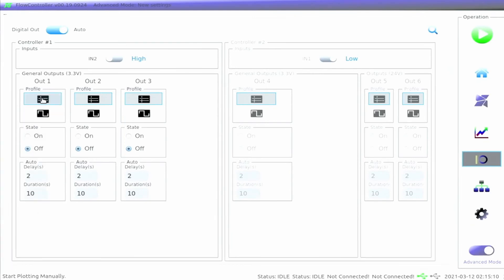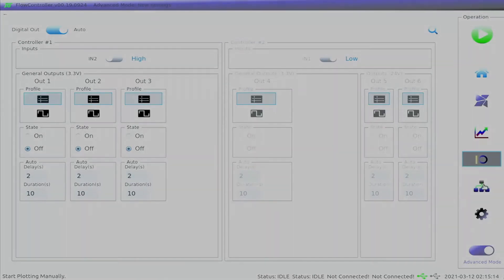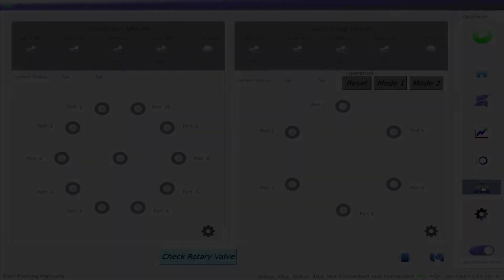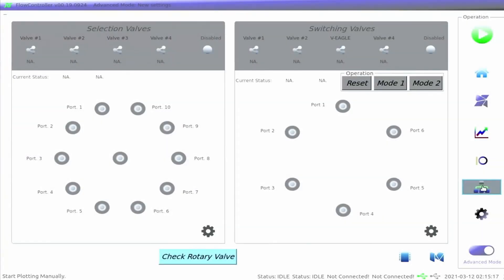Click the rotary valve icon in the function zone to access the rotary valve page. The blue check rotary valve button can be pressed to check and display valve connection. If a valve is connected at this point, the dialog box with the valve settings will show up as blue instead of grey. Users will be able to click on the various ports to choose each valve's position.